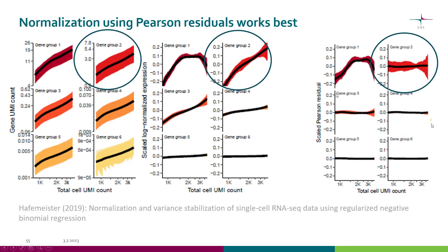After SC-transform, we actually managed to deal also with the medium expressing and high expressing genes. It's only the really high expressing ones that still have a problem. This image is from the paper by Hafermeister et al., where you can also read a more detailed description of this method.